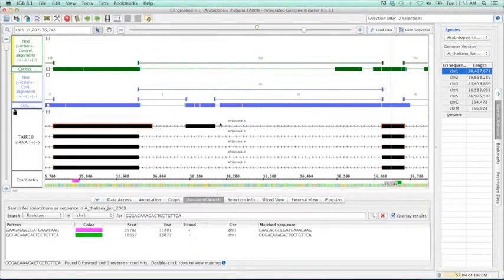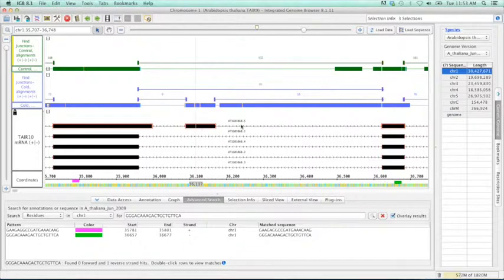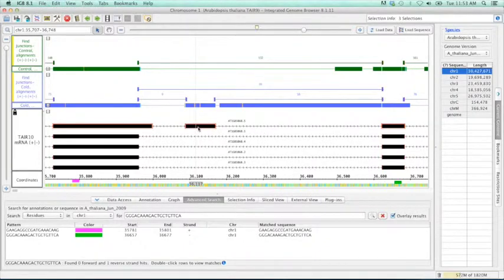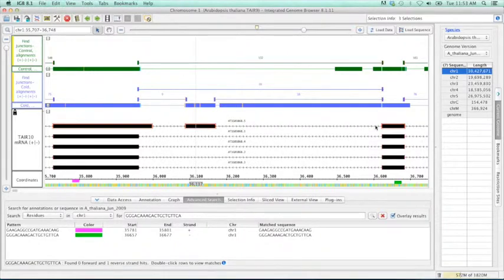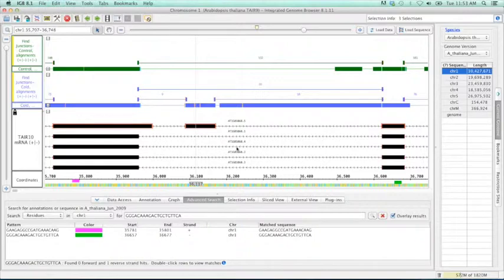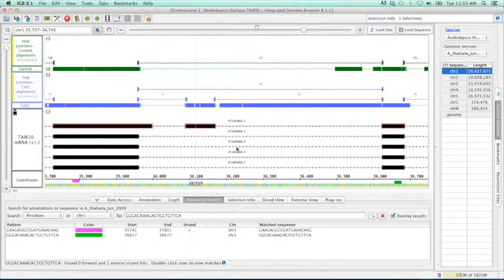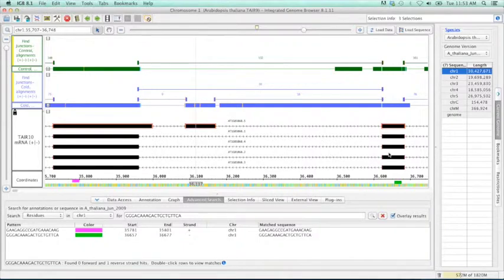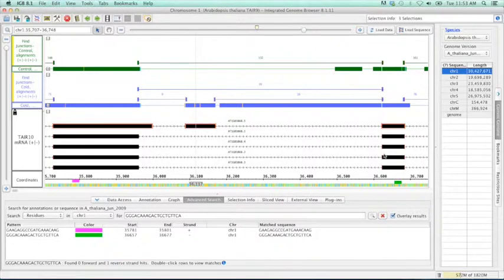So some additional functionality very quickly. It's important to remember that the residue primer search in IGBI is not BLAST. It's going to search for the exact sequence that you put in. The caveat to that is the use of wild cards.